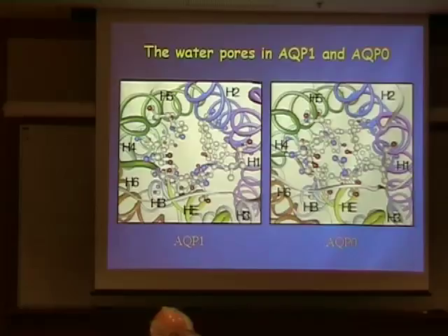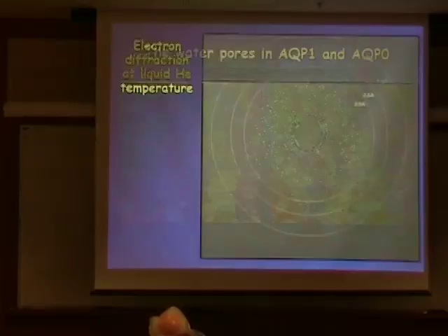Okay, so basically, we should be able with our microscope to get to whatever resolution. Nevertheless, what we needed was the presence of the high-resolution EM gold, and that's Yoshinori Fujiyoshi. So we took our two crystals and went to Japan to actually take some images and diffraction patterns. And we got very nice diffraction patterns with this microscope.